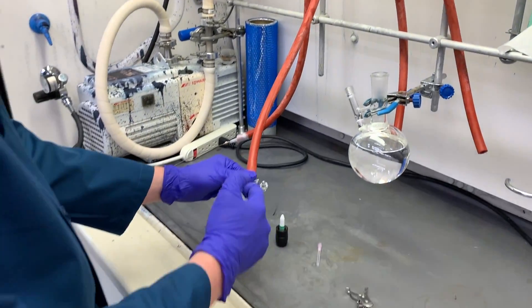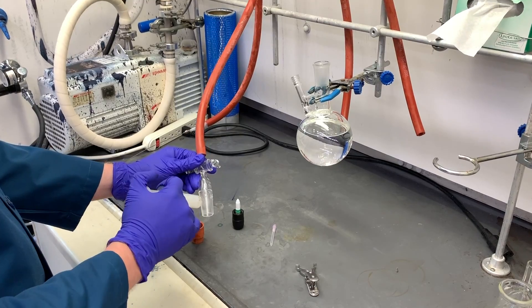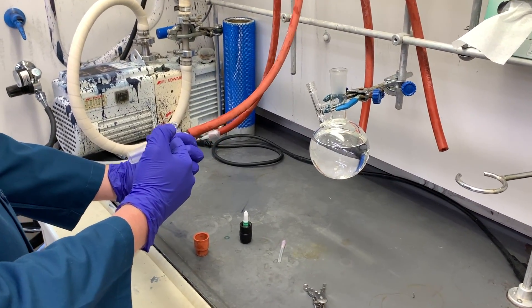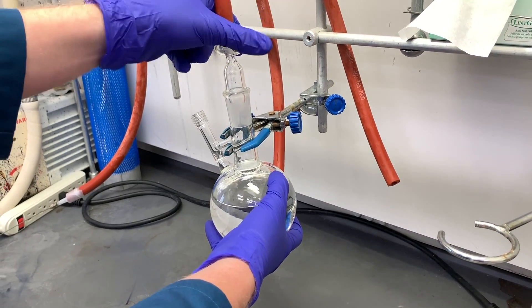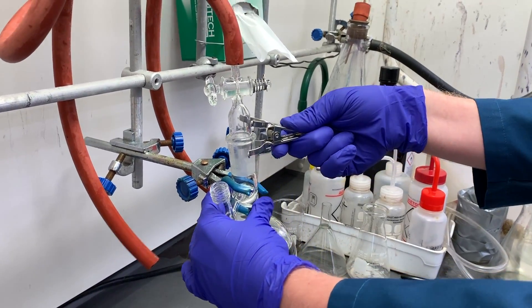Then connect one tap of the Schlenk manifold to your flask using a 24/40 hose barb adapter. Don't forget the grease and a clamp or rubber band to keep it firmly in place. We will be operating at higher than atmospheric pressure.